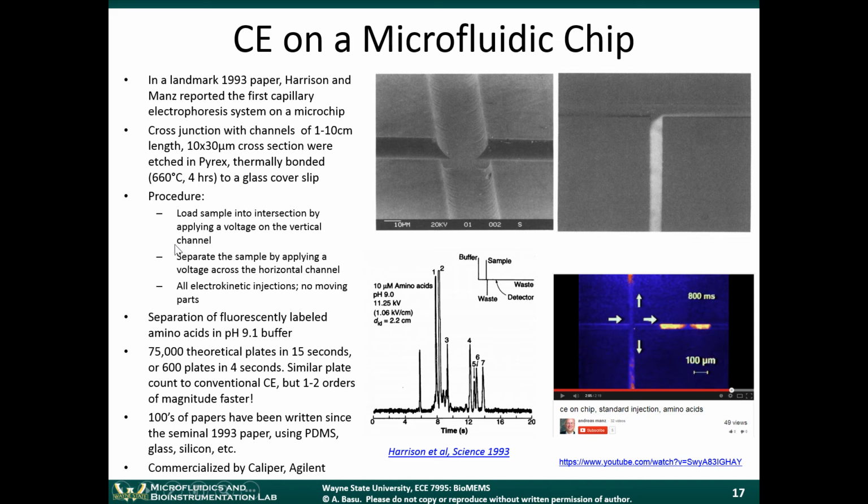And the procedure is similar. You do electrokinetic injections. Well, I shouldn't say similar. I mean, you still use electric fields to do the injection, but it's actually done in a pretty interesting way. Let me describe it, and then we'll watch this movie.